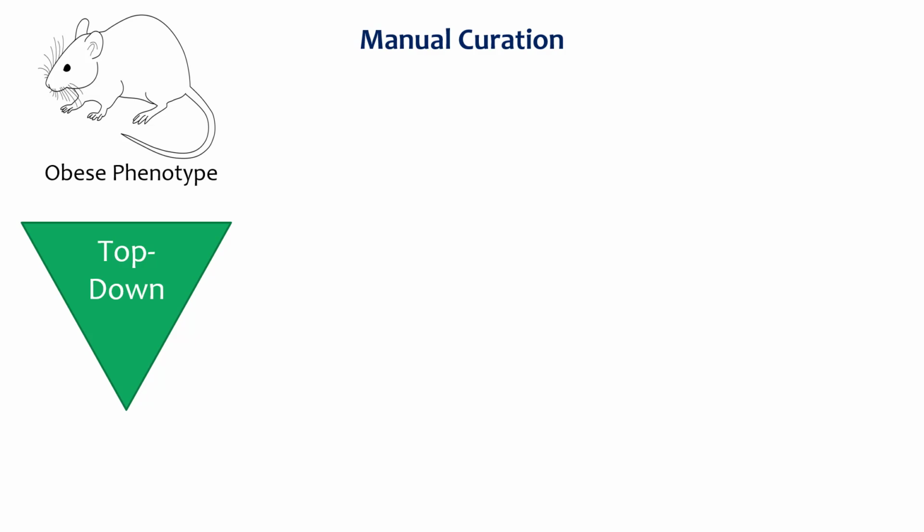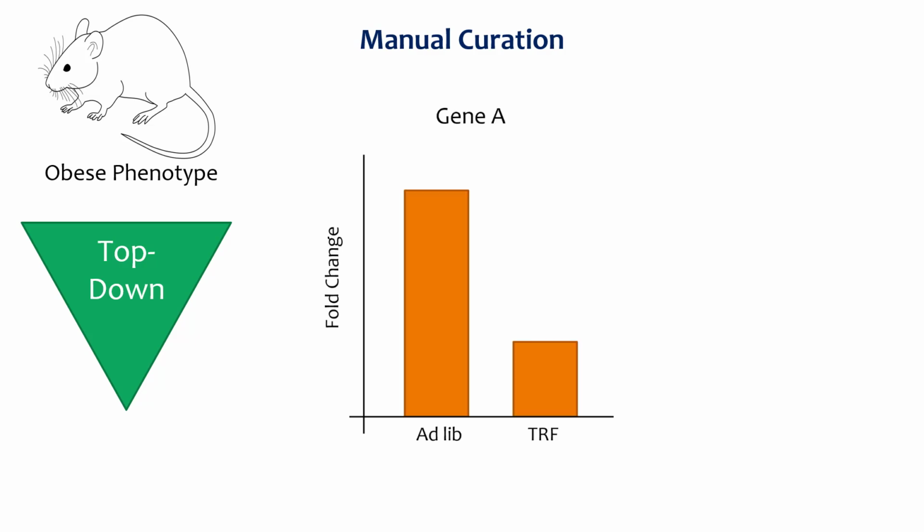A computational analysis can compare expression of these genes between feeding condition samples. Any genes that are expressed at different levels between the two conditions, which are said to be differentially expressed, can be further examined in future experiments to test their impacts on the phenotype.